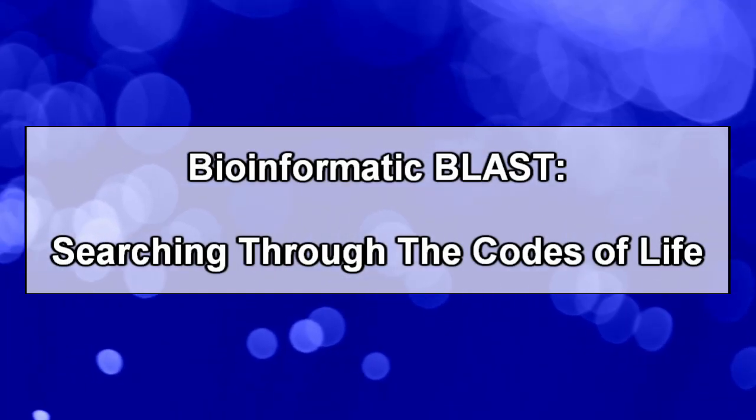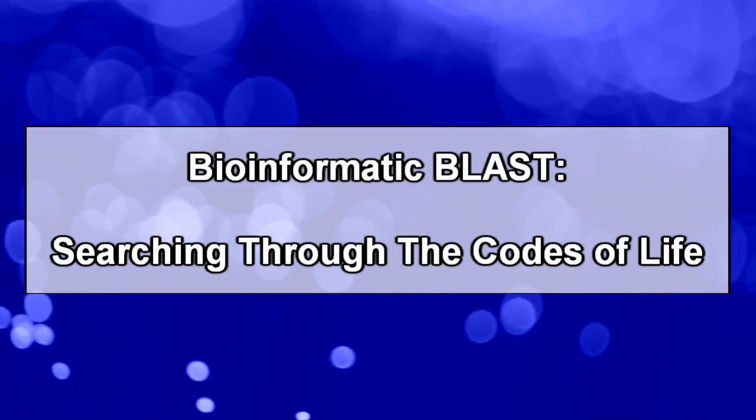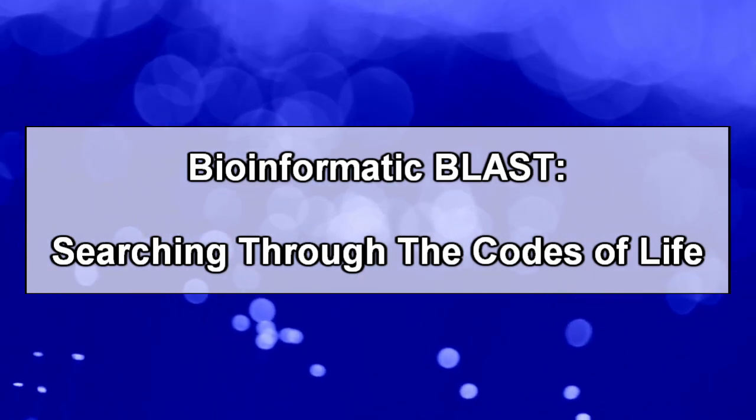Today we'll be talking about Bioinformatic BLAST, and we'll be working through some practical exercises.